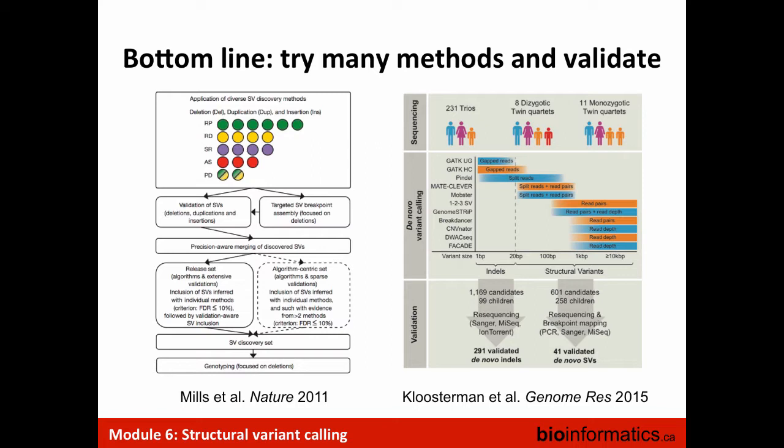So that's a way of enriching for true calls: if you see it independently from two different tools, that's a good indication that it's working. In both approaches, they used something like 10 algorithms, looked at the calls that were common, and then did a lot of validation. So it's working, and it's a great hypothesis generator, but there's no perfect tool that I'm aware of that can call all of them and gets it right all the time.